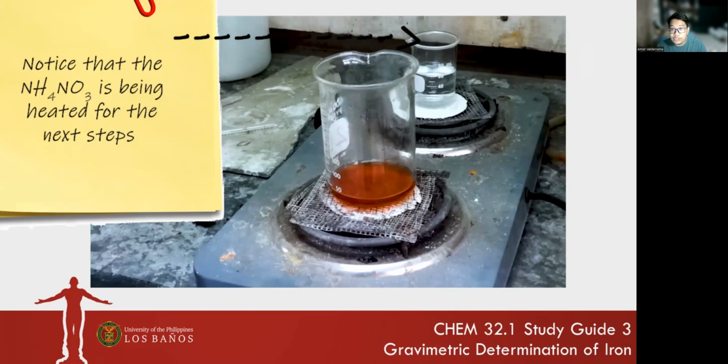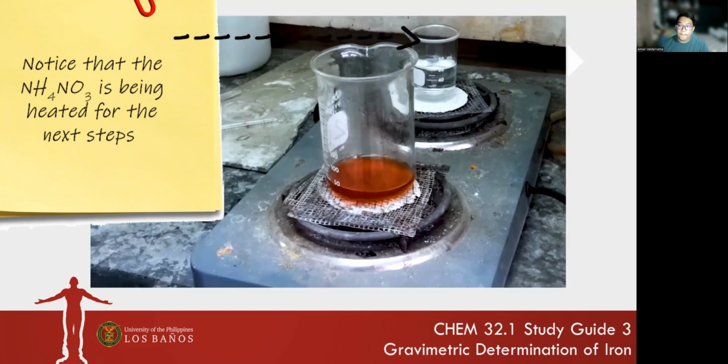If you use cold, this may result in premature recrystallization of your precipitate, and this will impede the whole analysis.